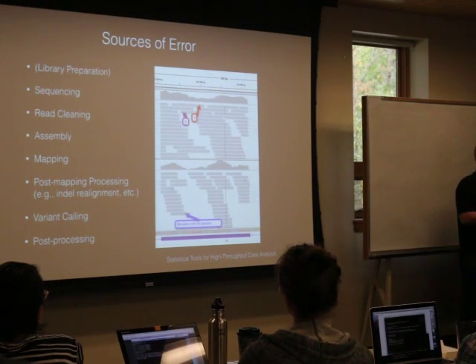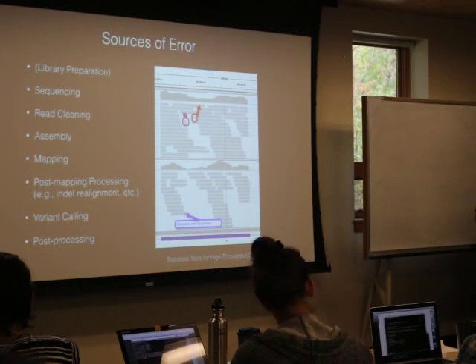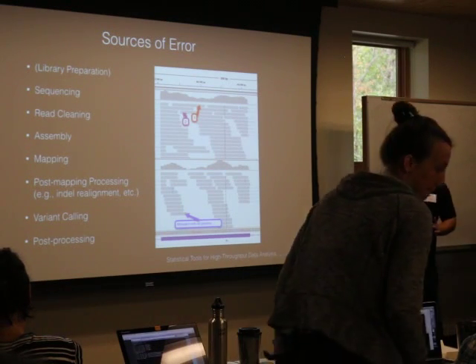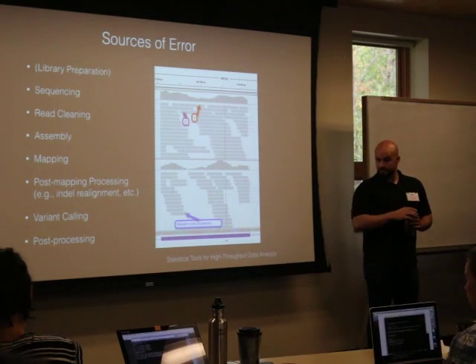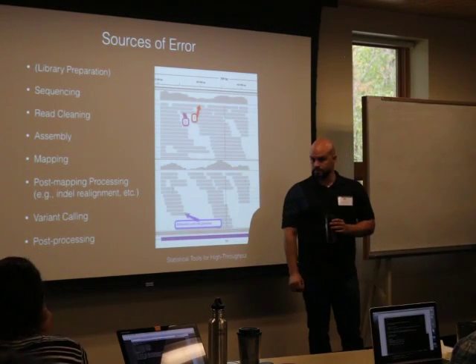And then post-processing. So this is the filtering that Gordon and Brett and everybody were talking about. So how you take those reads, how you take those variants and make sure that you have high quality variants in the first place. Just, hopefully this isn't a long answer, but for your post mapping, when you do the indel realignment, I'm presuming that's with GATK?